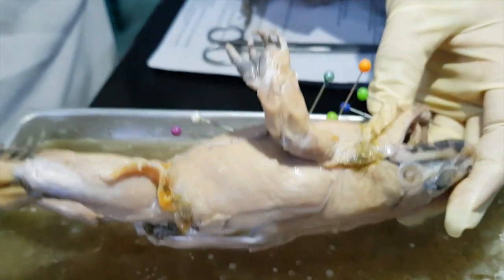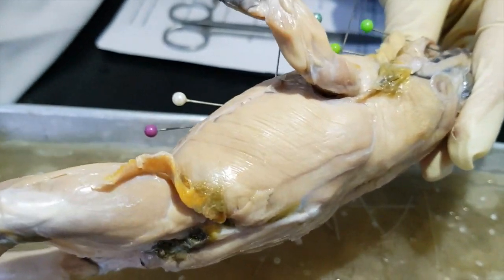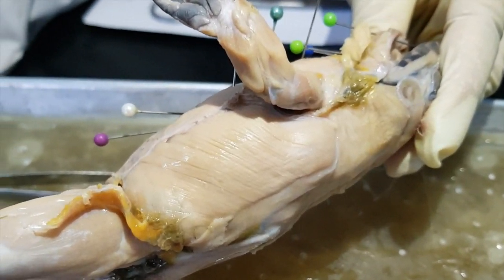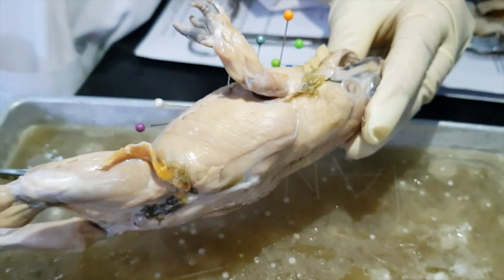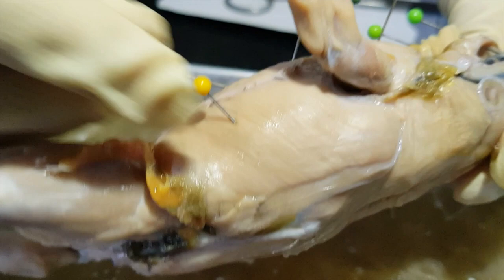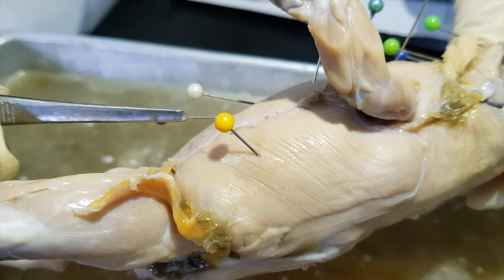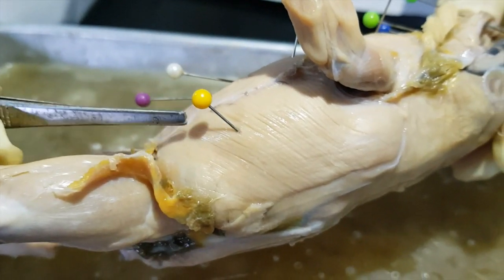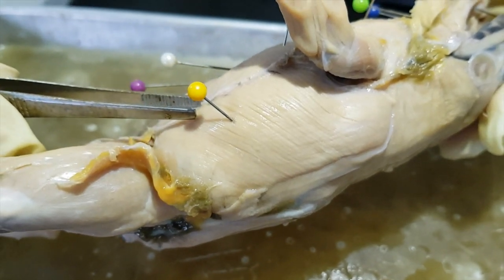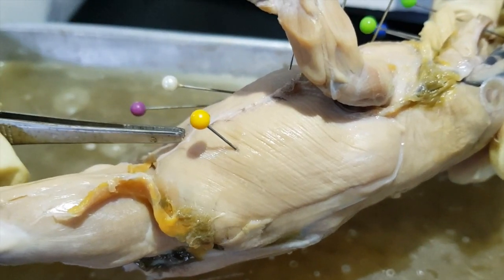Okay. On the side, with striations that run oblique, is the external oblique. Okay. If you deflect the external oblique, there are two other muscles beneath, but we're not going to do that. Just for the purpose of information, there's the internal oblique at the bottom and the transversus abdominis.